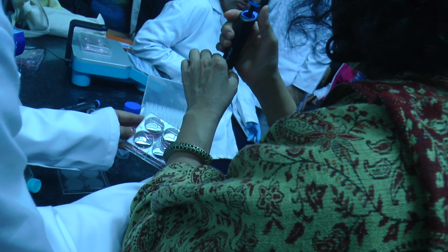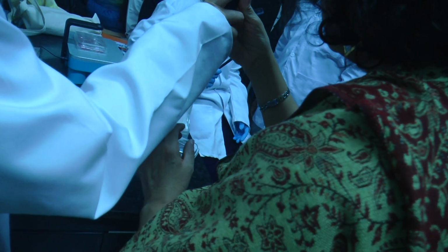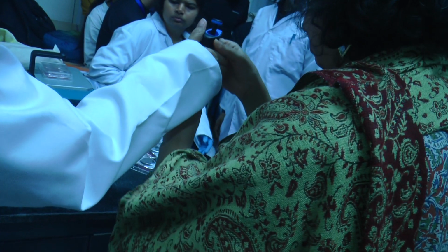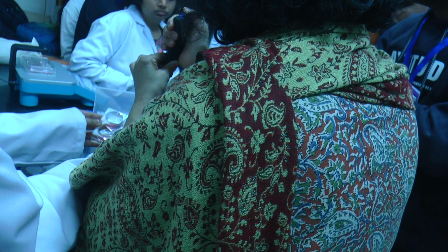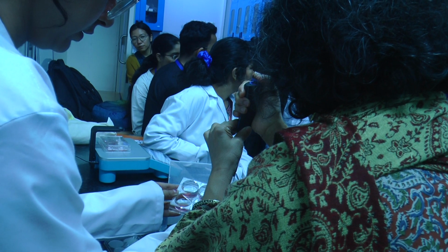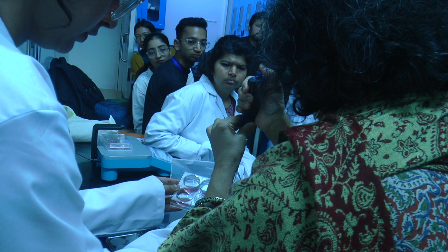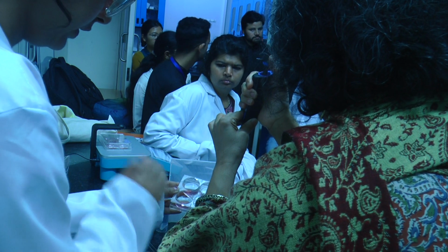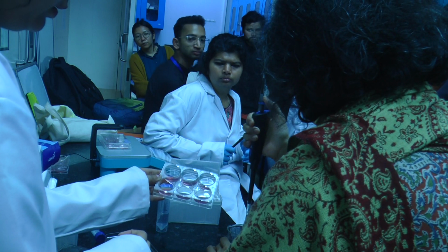Okay, how do you do it? You just press the thing? Yeah, I'll tell you. Just like this. Press it, then move it inside and slowly take it like that. Don't touch the bottom. You can do it a little faster also. Press it, yeah.